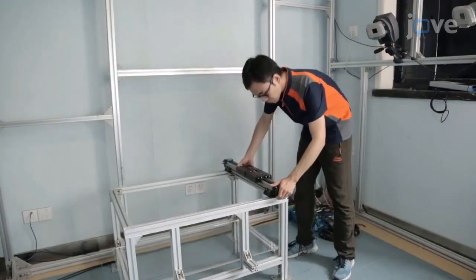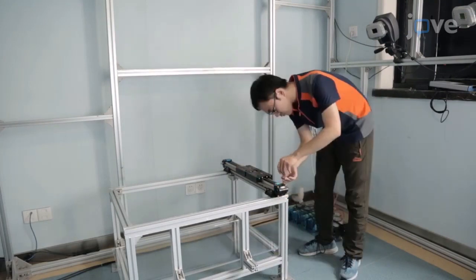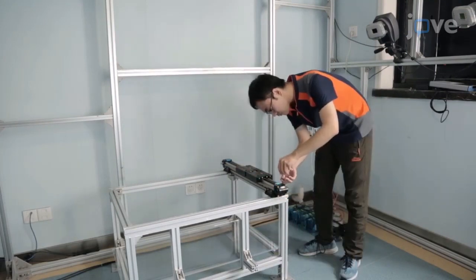Begin by fixing two Y-rails onto the top surface of the frame in parallel by securing the pedestals to the top surface with screws.